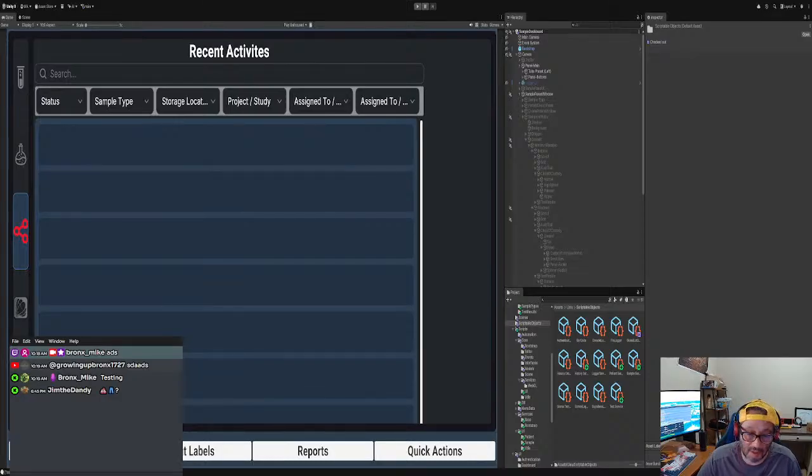Okay, let me just make sure you guys can see this. Window capture. Supabase. And then we are okay. Good, right? You guys can see it. There we go. All right, and then we're gonna make sure fit screen. Okay, there we go.